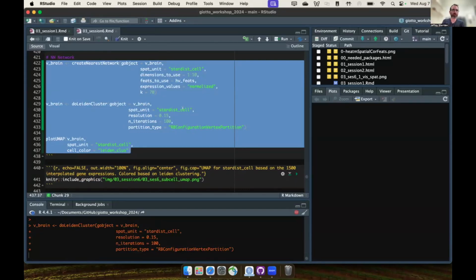Thank you very much, Ruben. Nearly at the end of this. So again, the more cells you do, and so the more complex your tissue, the longer you'll expect some of these to run. Especially if you start doing this on multiple data sets in a grouped format.